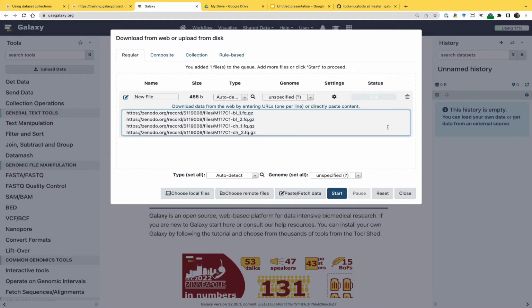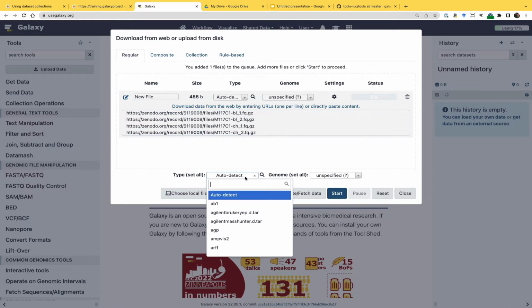All the data comes in different formats. And this is sequencing data in FASTQ format. So the problem with FASTQ format is it's a very bad format, but it is what it is, and we all use it, because there are different flavors. And there are historic reasons for that. And the flavor we all use today is called FASTQ Sanger. So to just avoid any complications in the future, let's actually tell Galaxy that.